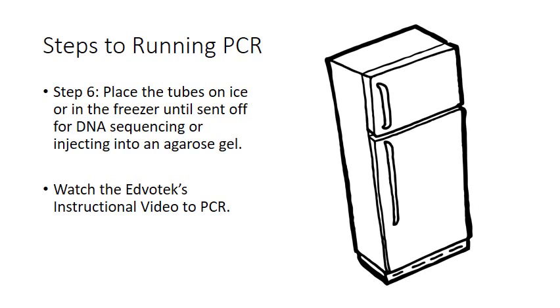After you've placed the tubes inside and it's done its copying, usually the thermocycler is so awesome because after it's done, it's going to cool the temperature down to like freezing. So your PCR tubes, when you get them out, if they've been sitting inside the thermocycler, are going to be pretty cold because it will decrease the temperature as well as increase it. You get them out of that heat block, and they're going to be really cold, if not frozen, and that's what you want. You want them to be ice cold to store your DNA sequence. And so the last step is usually to freeze.